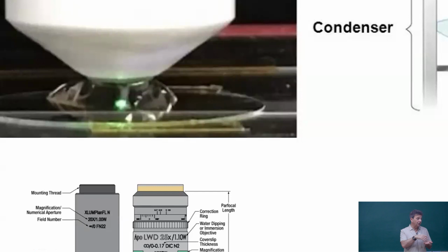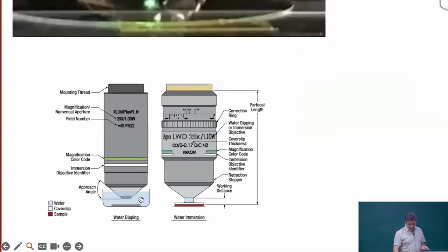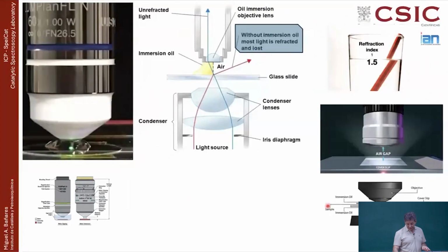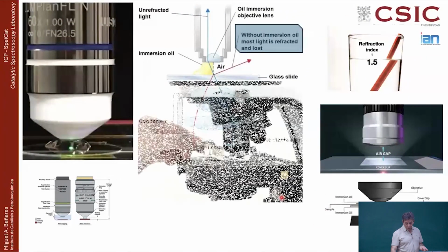Going from air to solid and liquids usually go from a refraction index of 1 to 1.5. So basically there is a commercial oil which is used to do that. And then either you do immersion in the same liquid or you use this oil, and then you avoid that problem. And then you can see inside without being fooled.